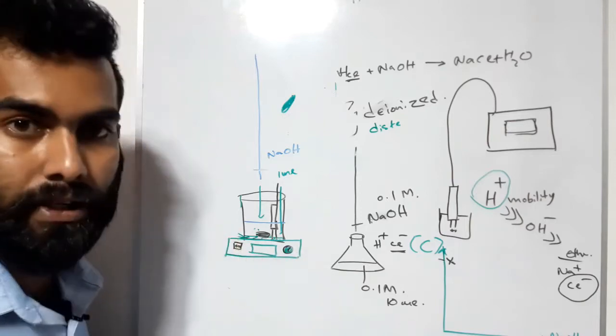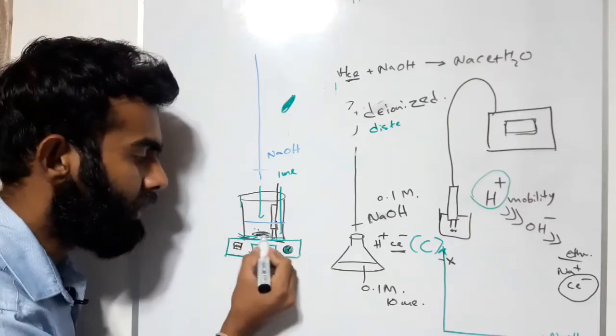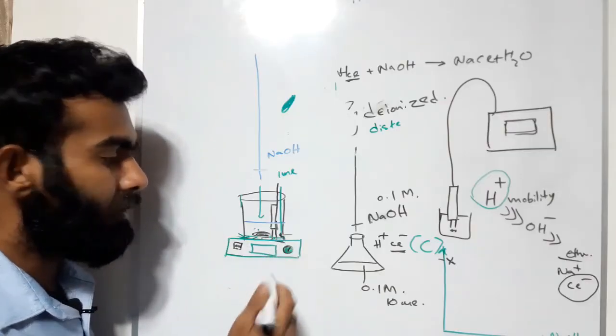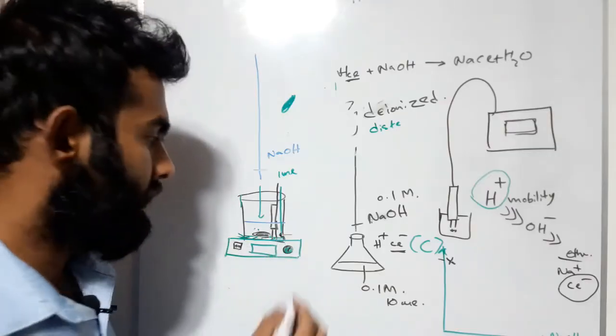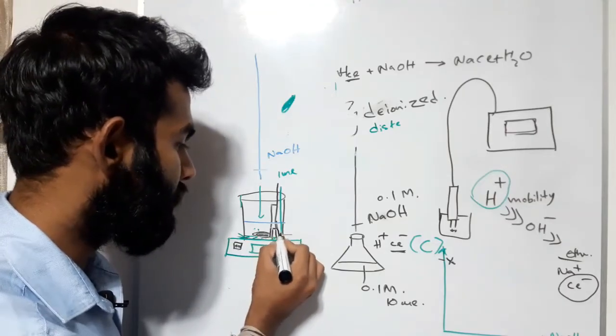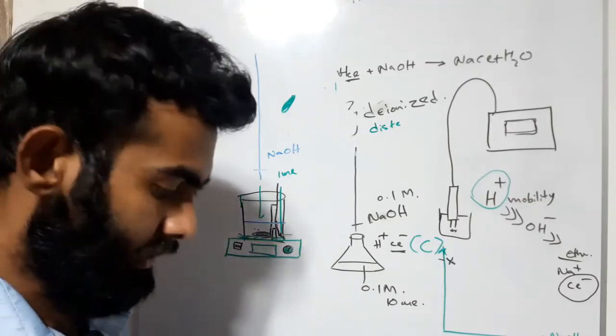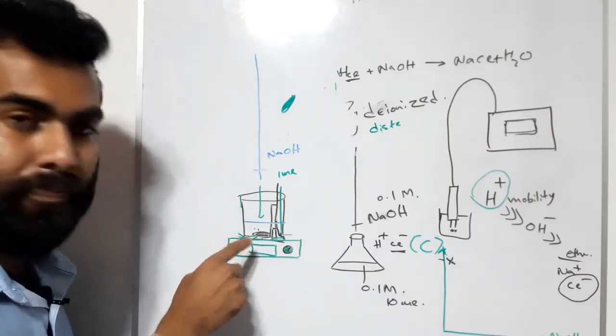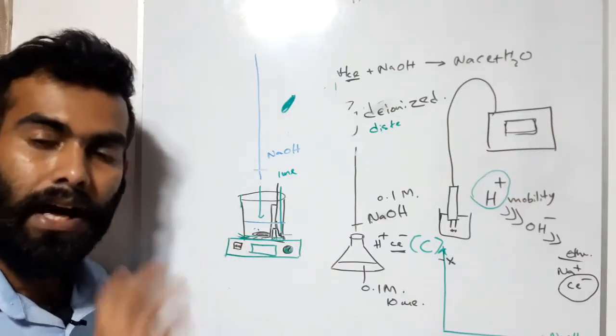When we are using this magnetic tablet, we have to take care about the conductivity meter cell. The edge contains a glass cover, and it will be broken if the magnetic stirrer hits the glass cover.